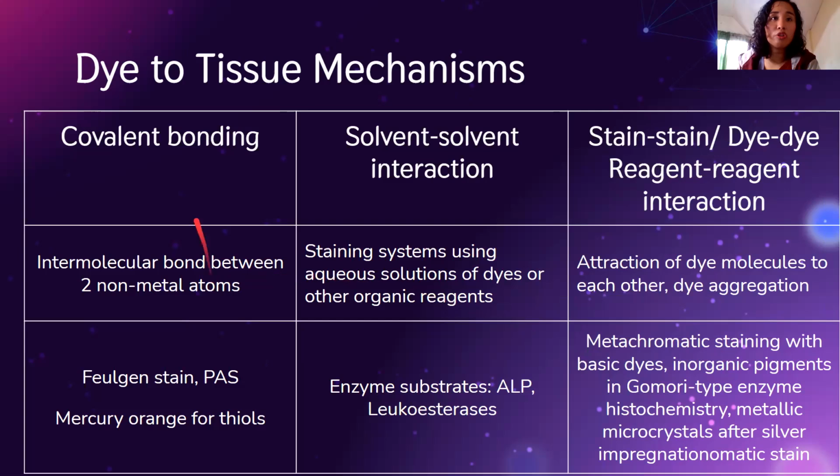We also have covalent bonding, two non-metals. Solvent-solvent interaction. So, guys, when there is water, when there are aqueous solutions, they have an interaction with each other. Staining systems using aqueous solutions of dyes. When there is water, one could dissolve in that solvent.